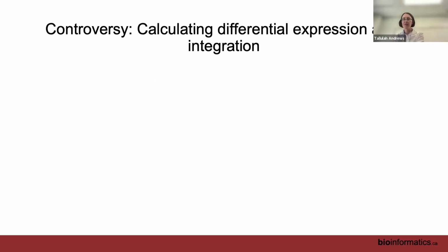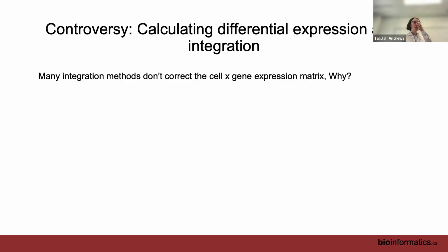Yeah. So then the last thing I want to talk about here is this controversy with respect to calculating differential expression after integration. So you might think, hey, if there are all these technical effects that are causing noise in our data, we should get rid of those to improve our differential expression test, right? Seems very natural and logical. The problem with that is that almost all of these integration methods and batch effect correction methods don't distinguish technical versus biological differences between samples.